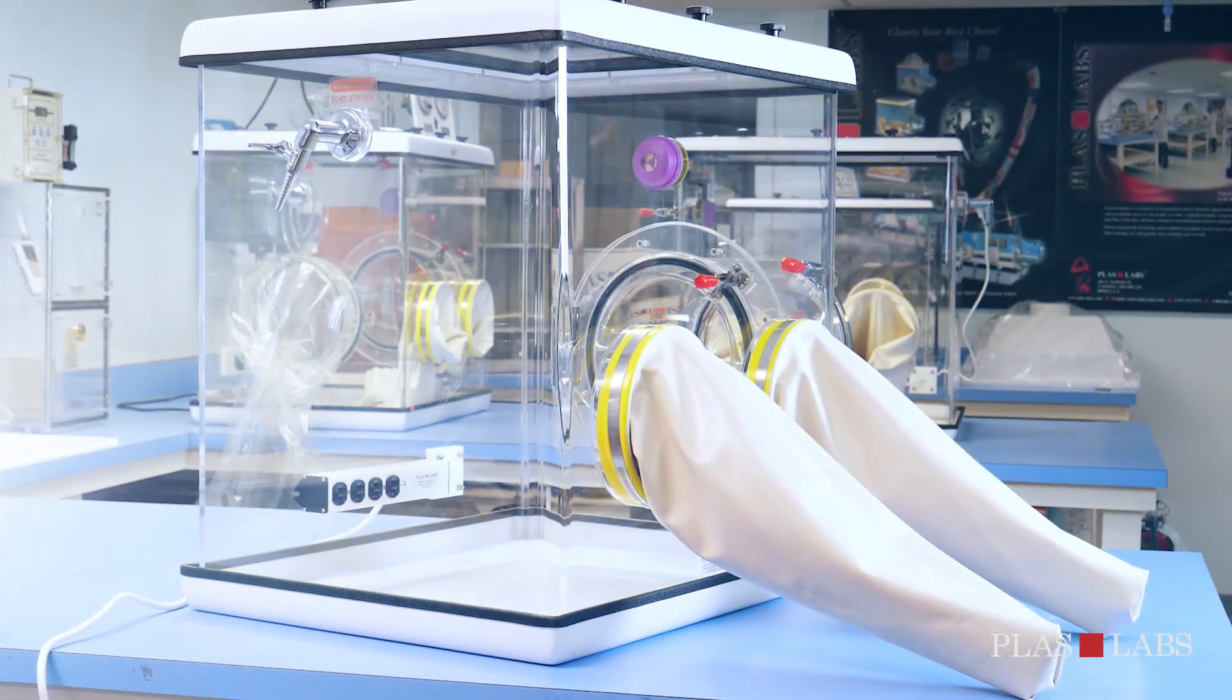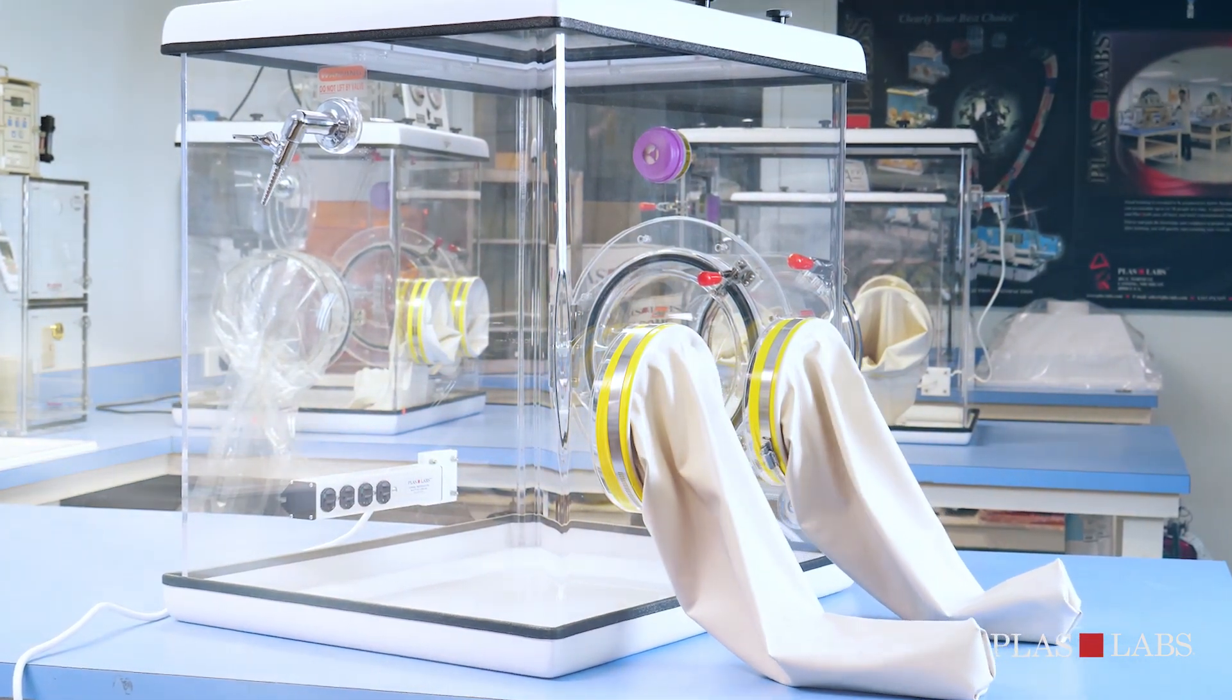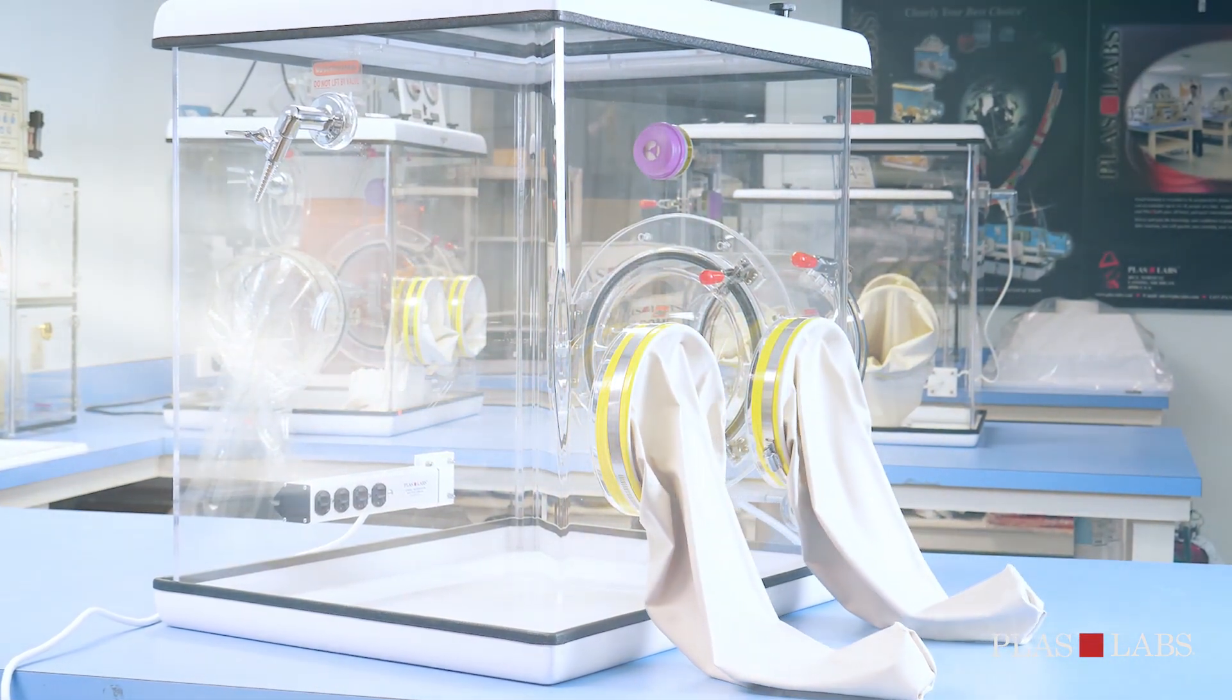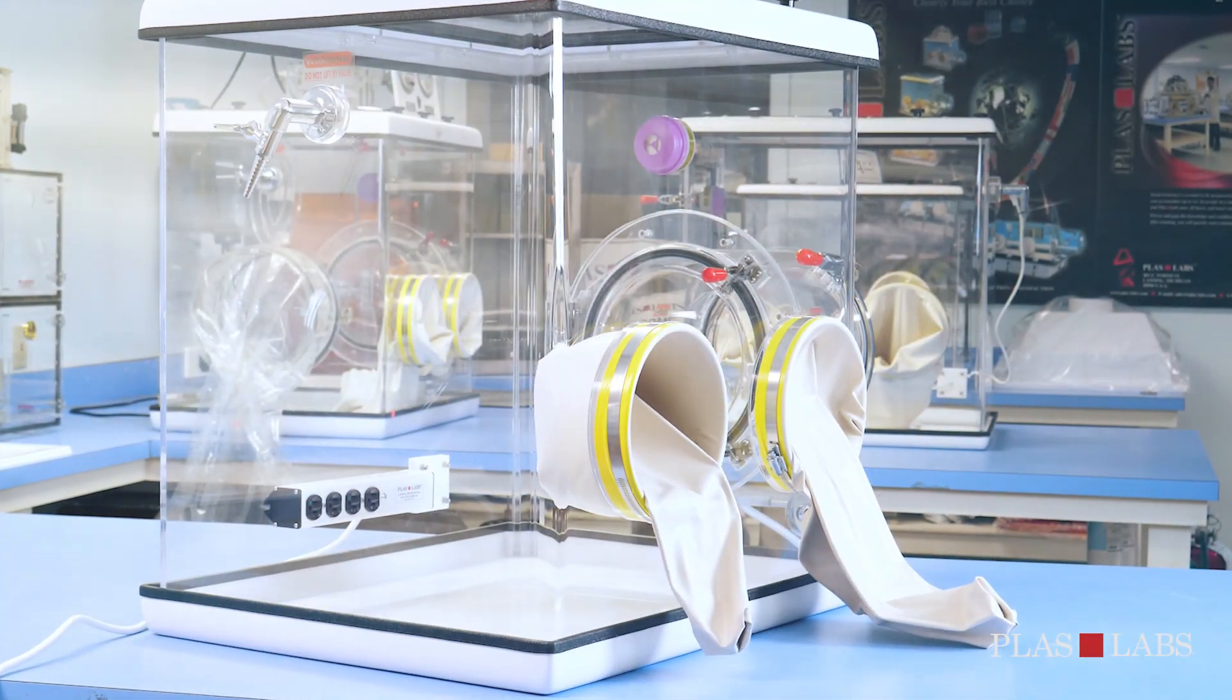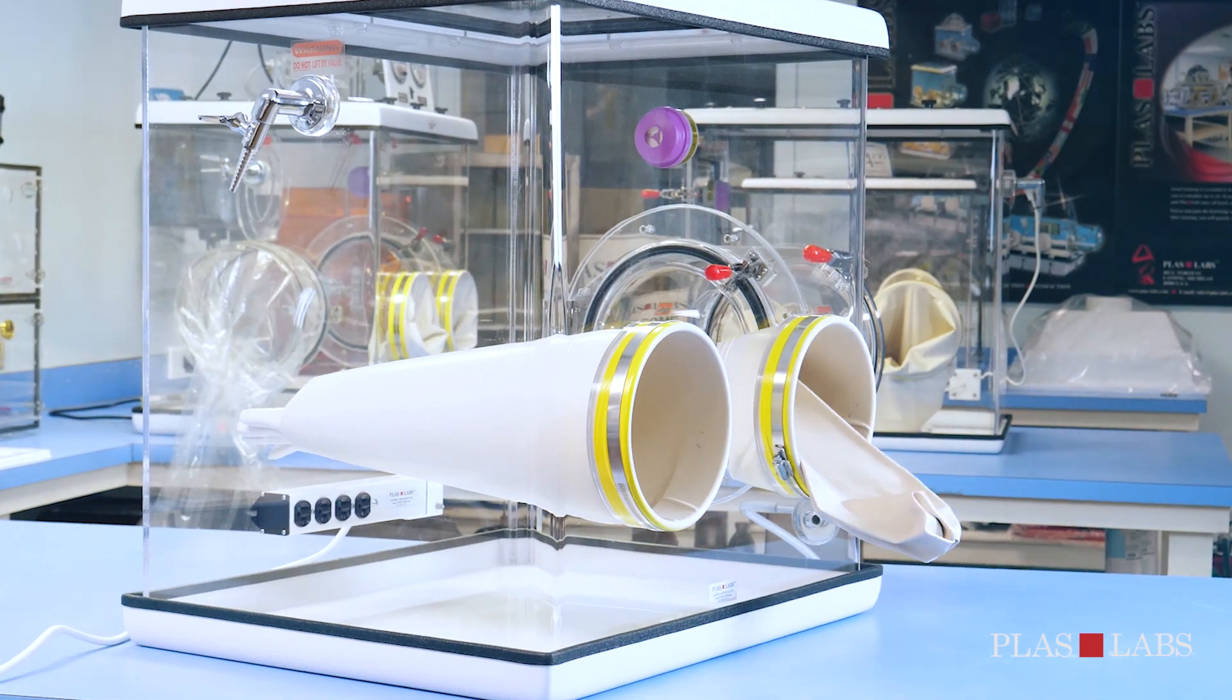The 830 series has been developed to minimize drafts and maximize the effectiveness of your analytical balance. It can also be used with any inert gas to reduce oxygen and moisture levels inside the glove box.